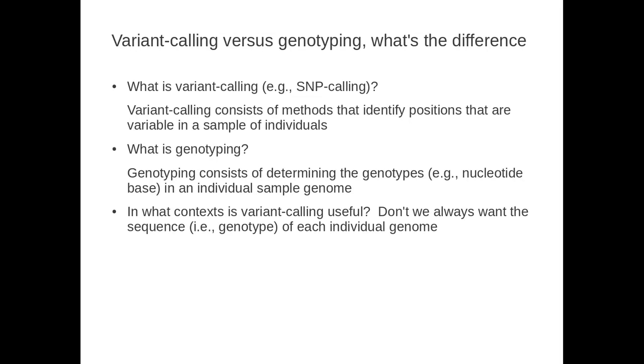So the problem with calling genotypes ultimately is that you need a lot higher coverage data than you do just to say whether a site is polymorphic, i.e. that it's a variant in a population. Genotyping requires deeper coverage, oftentimes above 10x, 15, 20x, or higher are frequently referred to as higher coverage, and therefore we can get more confident genotypes.